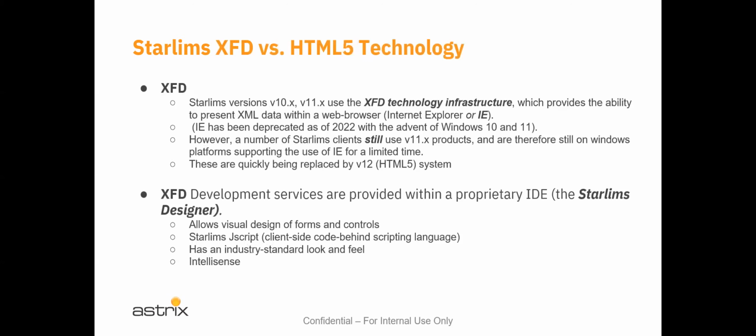So STARLIMS went through a little bit of a process in its infancy and through its maturity. And the reason we need to talk about this is because there are two components of the systems that are out there currently that we, as consultants, are going to have to deal with. So there are quite a few what are termed V11, version 11 products, which operated under the XFD, extensible forms in the older technology. And then the latest product, I would believe would be a version 12 and beyond, will be HTML5 technology.